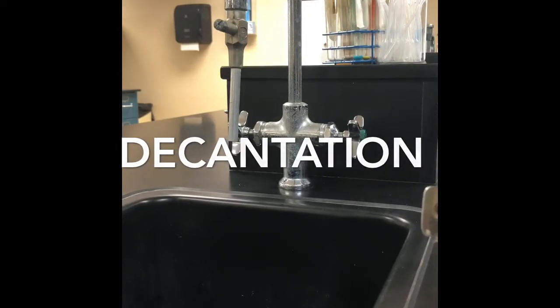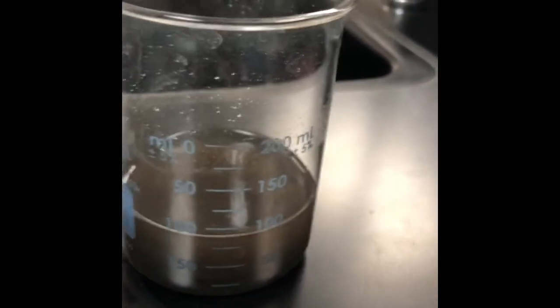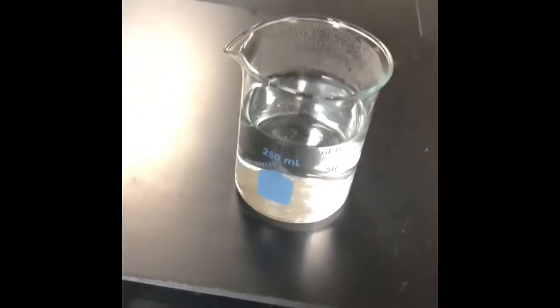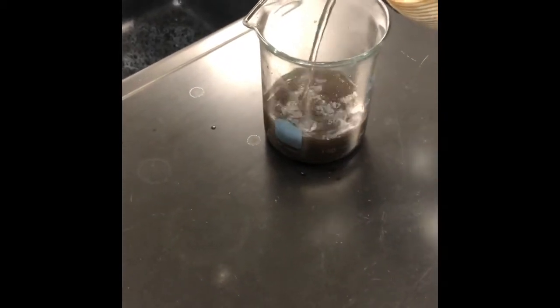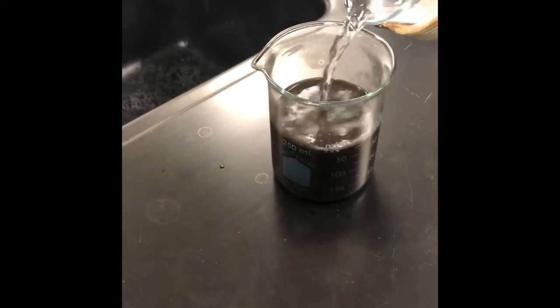So I still have quite a bit of water to pour off. First decanting, we have a little bit of liquid left. So what I'm going to do is use the water that I had on boil earlier in the experiment, and pour a little bit of it into my beaker, and we're going to do another wash. We're going to repeat this process twice, usually is what I like to do, and we'll pour it off again. Okay?